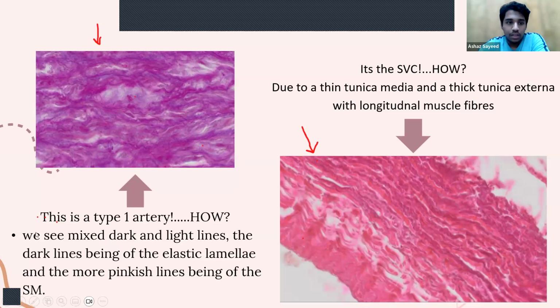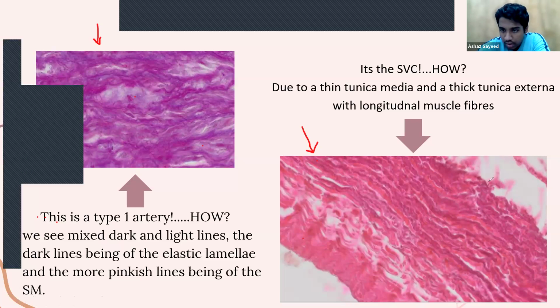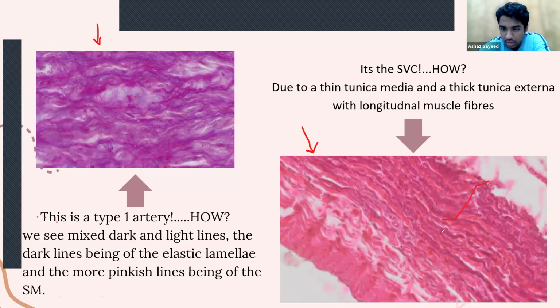How? Once again, this is a huge external layer, the tunica externa. And the tunica media is pretty small. Okay, so that's why it's the SVC. And we are done with this lecture.